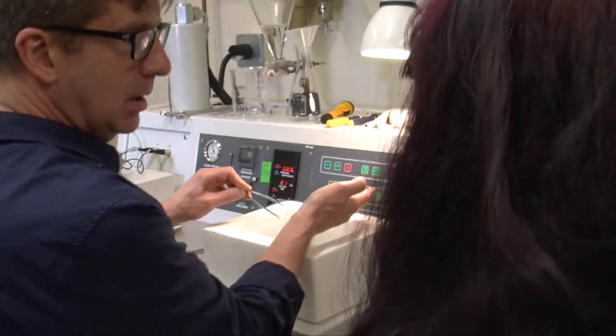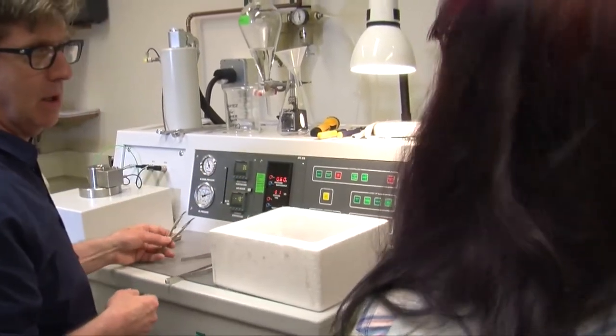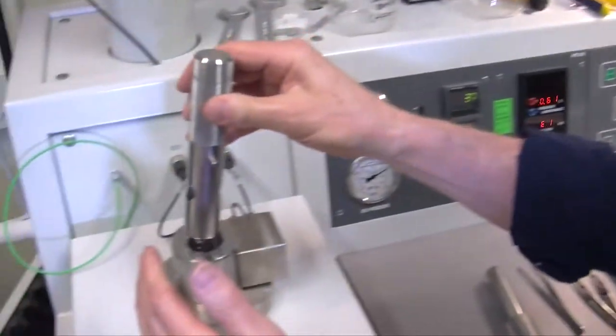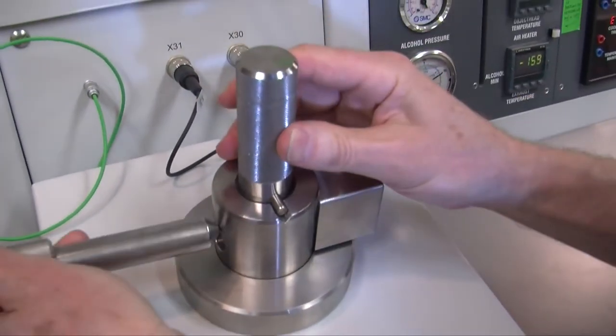What you're doing is you're freezing a sample at as much as 33,000 psi, sometimes a little bit more, and at the instant that all of that pressure hits the sample, you're also freezing it at liquid nitrogen temperature.